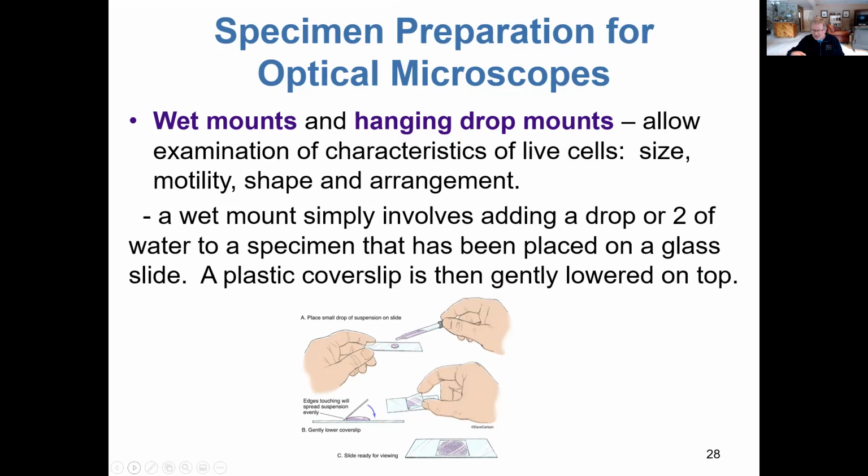Take a leaf off a plant and add it to your slide and examine it. And it's a very simple process. All you do is you take a clean glass slide, put your specimen, maybe a leaf, if it's a structure you want to examine. It could be an insect, butterfly wing, maybe you put down there, or it could simply be a drop of pond water too.